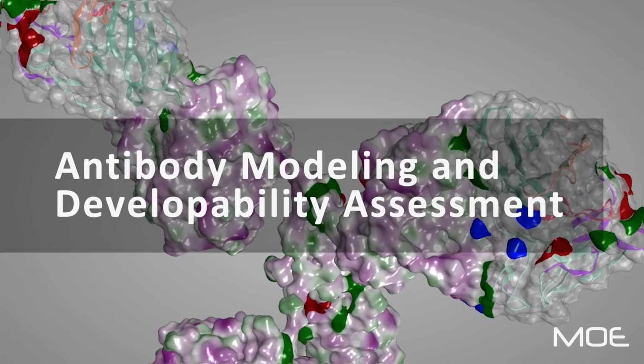Today I'd like to show you how we can model a mouse antibody and inspect it for liability motifs. We'll then model a panel of 14 candidates, also inspect those, and then choose the most promising in terms of improved developability. So let's get started.